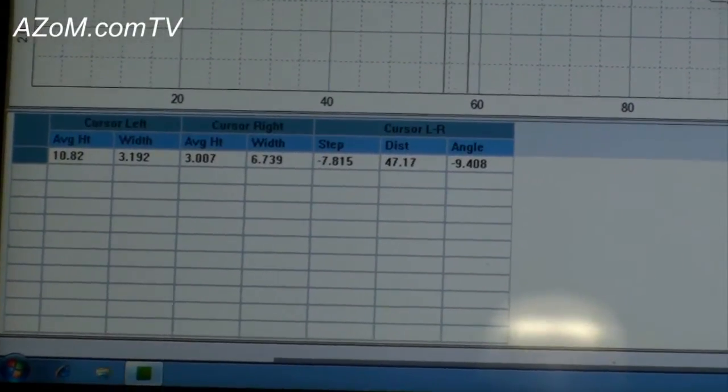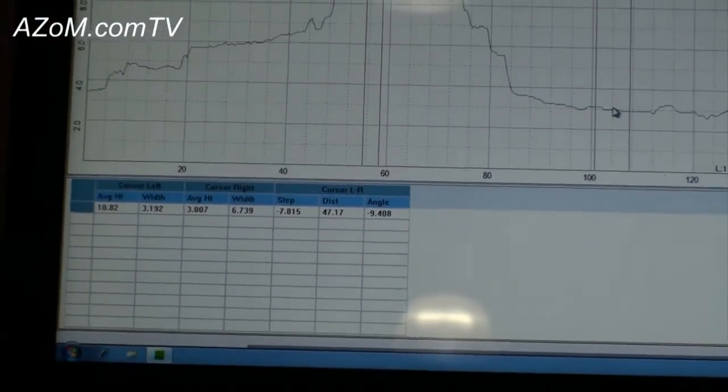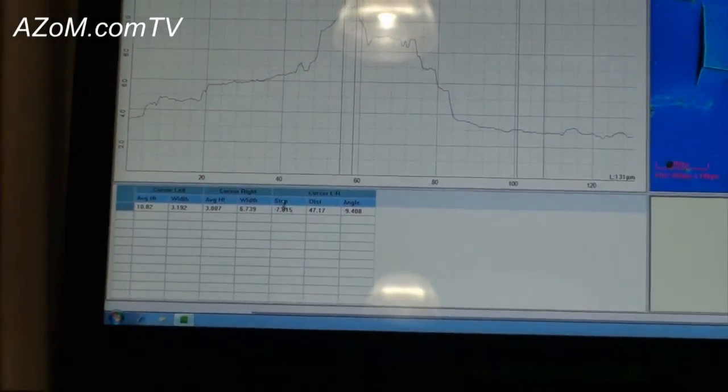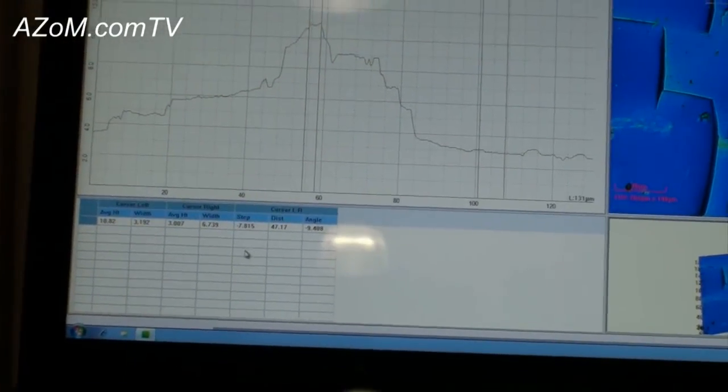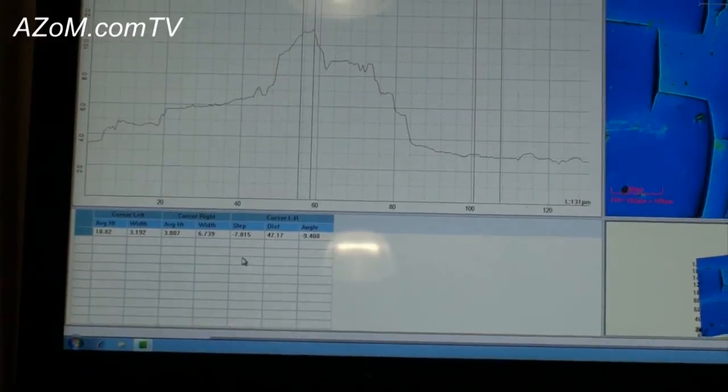Most importantly, if I wanted to know this particular feature, which can be any sample type, I would be measuring a step down in this case, minus 7.8 microns. So it's an optical profiler.